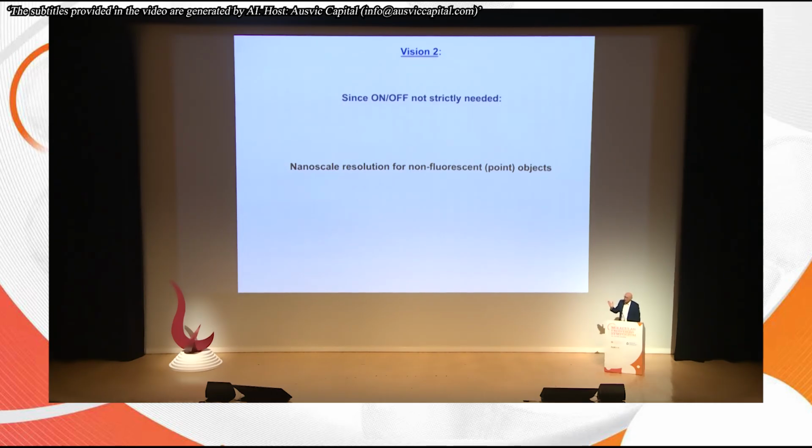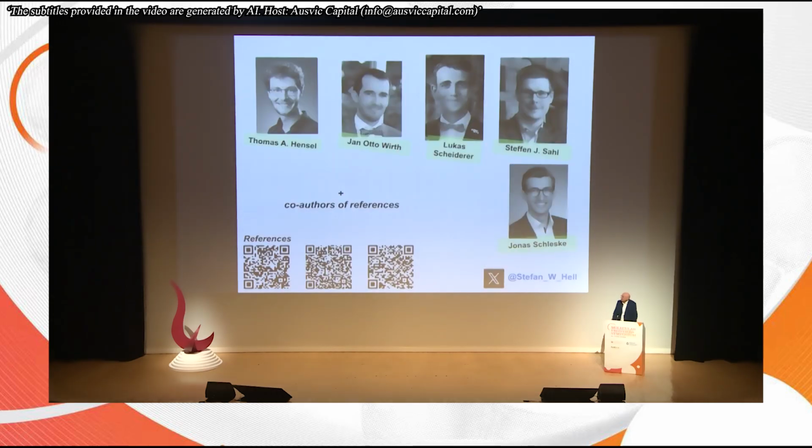It means now that we can apply this methodology to anything. It need not be fluorescence, as long as you have point objects and they stay very close. So I think transferring this to Raman scattering, other types of contrast is definitely viable. So this is something that is coming up. Another new avenue that's coming up.